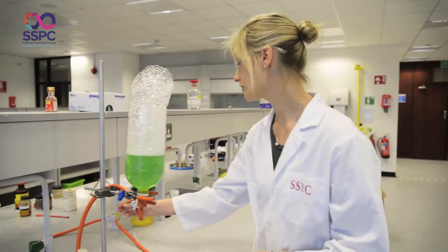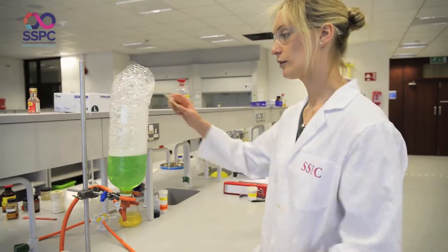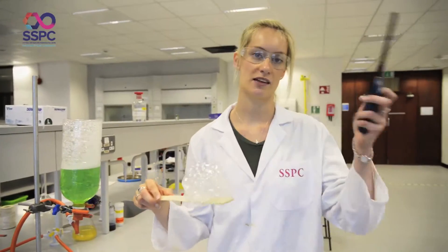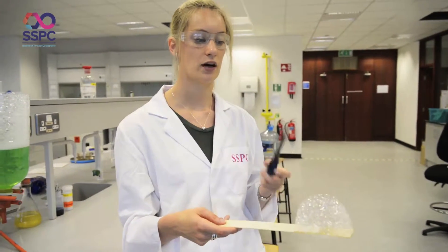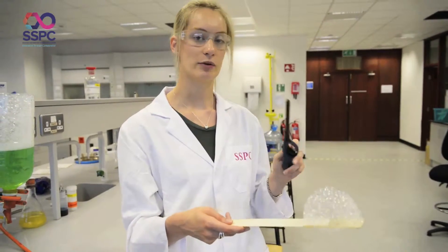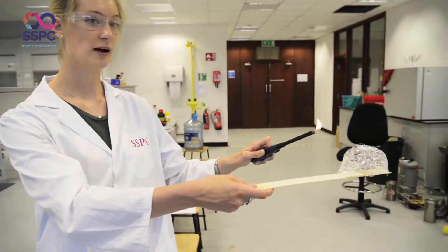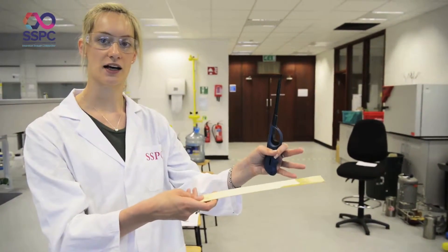We're used to seeing bubbles that we blow as children — we create these bubbles and set them off. In those bubbles we have a mixture of all different components of air and our breath. But in these bubbles we have pure methane gas. This clearly and dramatically illustrates how a very small amount of gas can produce a very, very big flame.